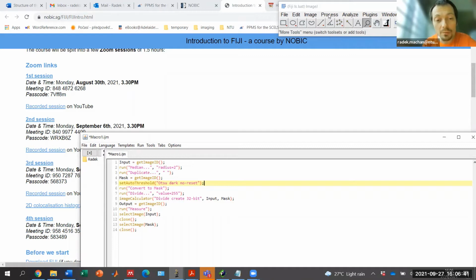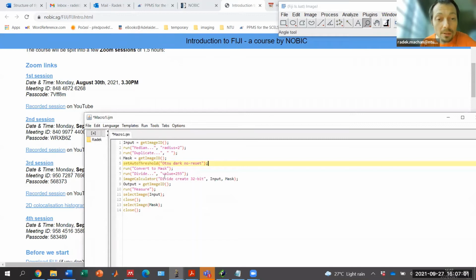You might want to do some processing on all the images, and then, for example, generate a single output from all of the processing results, or from all the analysis results.